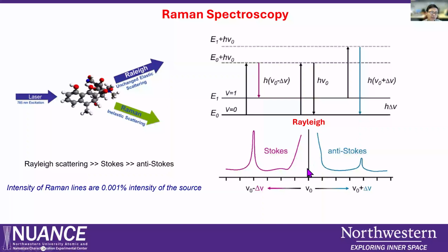That's why in the Raman spectrum, you don't include the zero wave number, because that is basically the laser light, and the Rayleigh scattering is very, very strong. You have to use a filter to remove this. Mostly the molecular vibration is at the ground level. The laser excites them to a higher level, they absorb that energy, and the laser light loses that energy and comes out. That is called Stokes scattering. This lost energy is the vibration, given as a wave number, and you get the Raman spectrum.